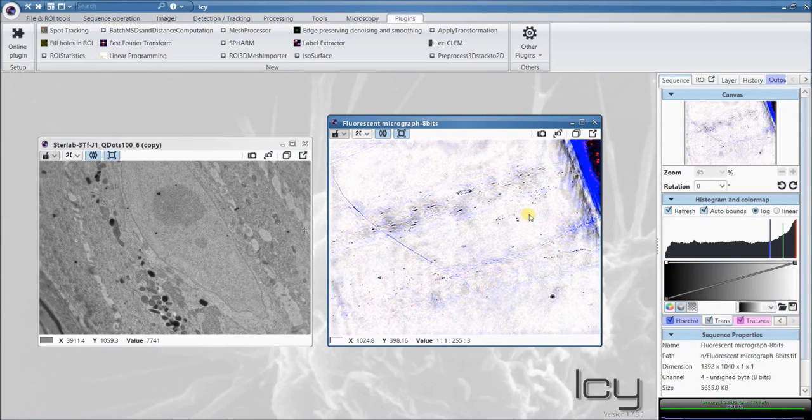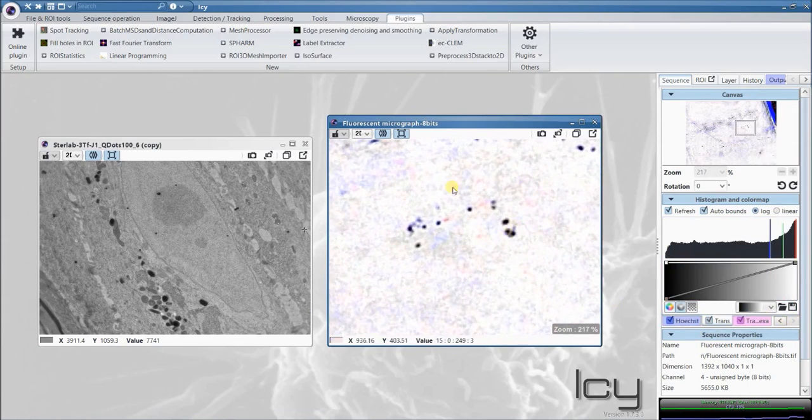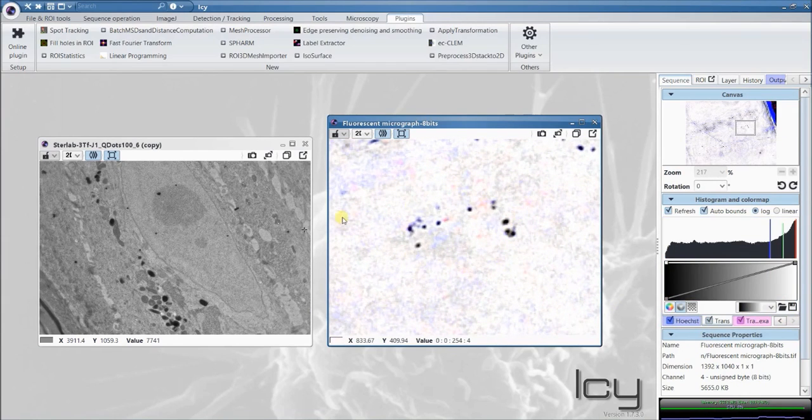When we zoom in here, in this region, we see that those melanosomes correspond to those guys.